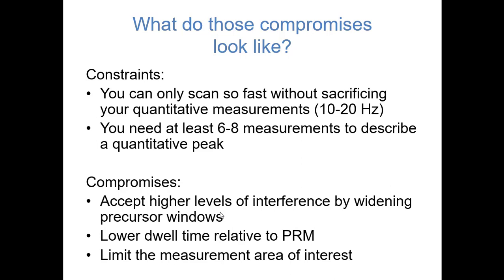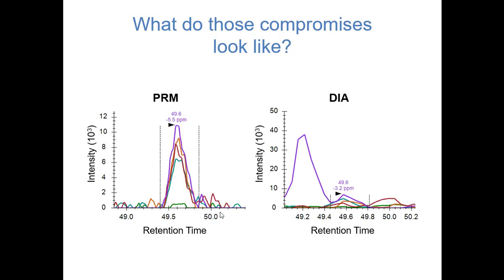And so the third way that you can limit this is you can also just say, I'm not going to try to actually measure all the peptides. I'm only going to try to measure peptides that have precursor charges or parent ions that I expect, in terms of the mass to charge range. Okay. And so we end up with data that's sort of like this.